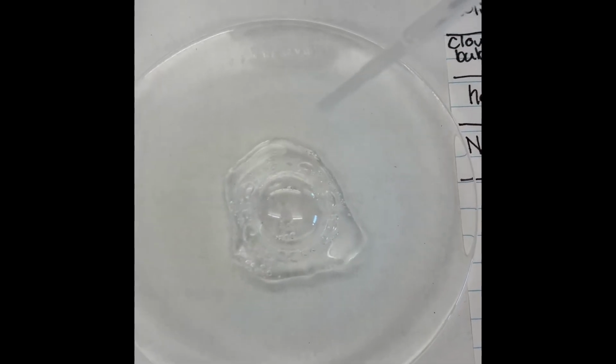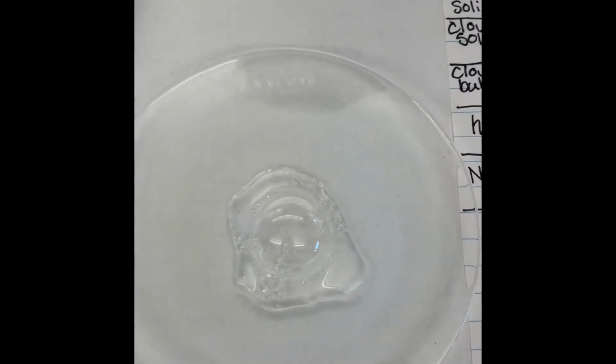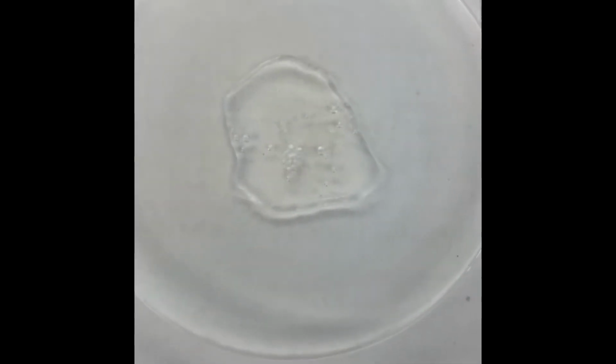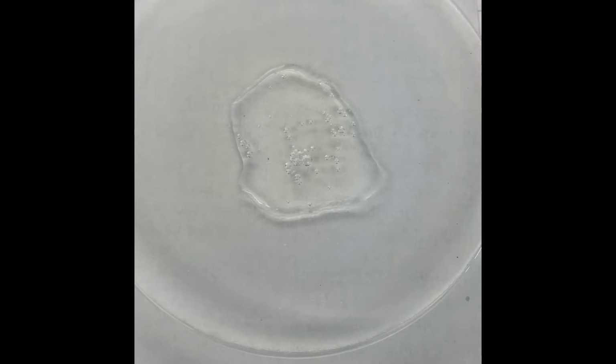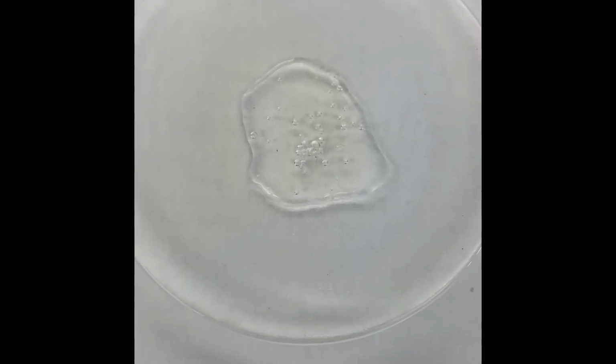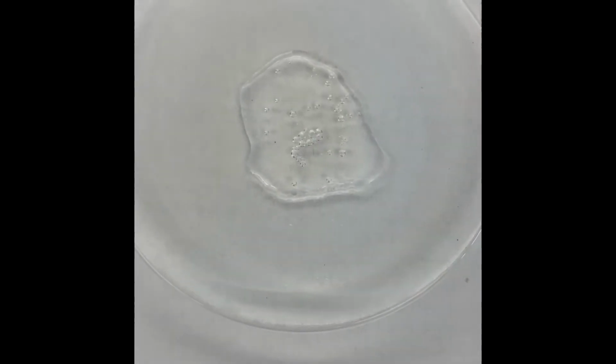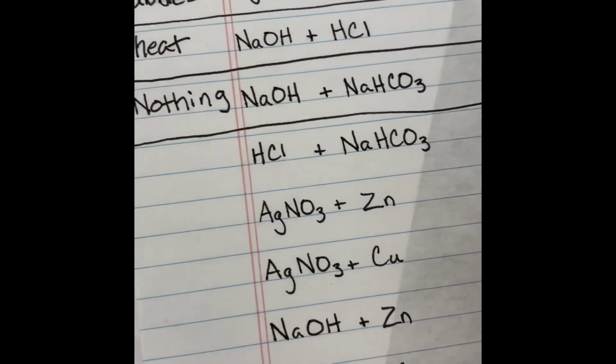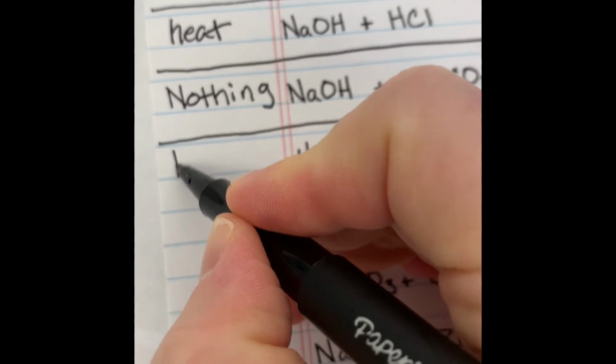All right, lots of bubbles. Just for fun, try mixing vinegar and baking soda at home and you'll get a similar reaction. So here we go. Let's just record bubbles.